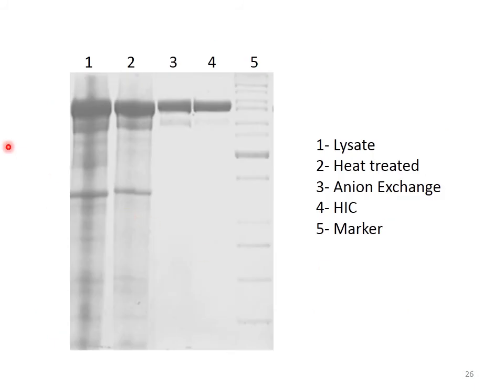This is an SDS-PAGE of a protein showing the purification of the protein through two steps of chromatography. So here, this is a lane of the gel which shows the protein of interest, and then there are many other bands of proteins as well. So it's a complex mixture containing many proteins in it.